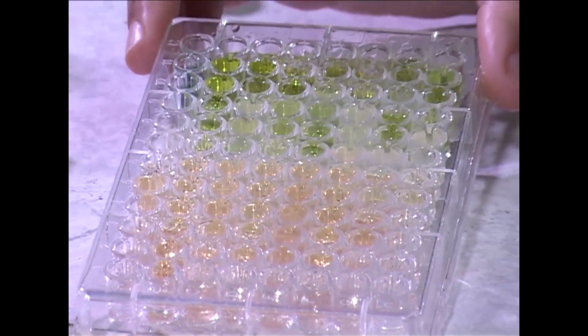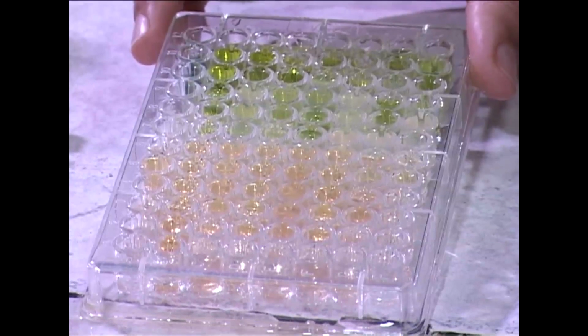Clear? Then we have to see the coloration. Now can you tell me why we are washing the wells after each addition? Yes, ma'am. I suppose if excess antigen is present in the sample, then it may give a false result. So hence washing is necessary.